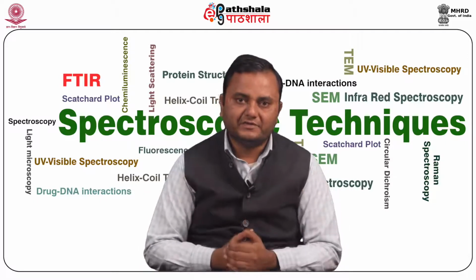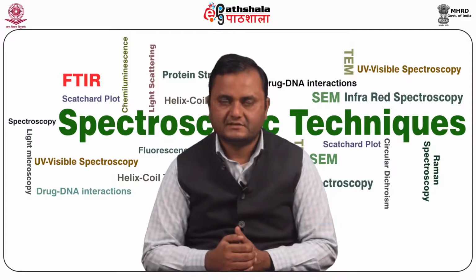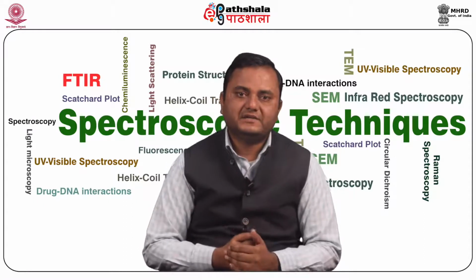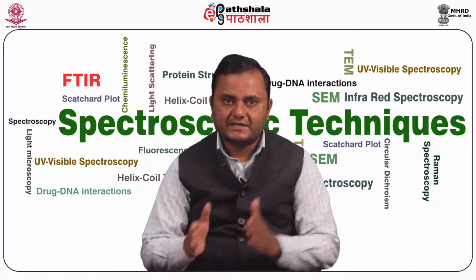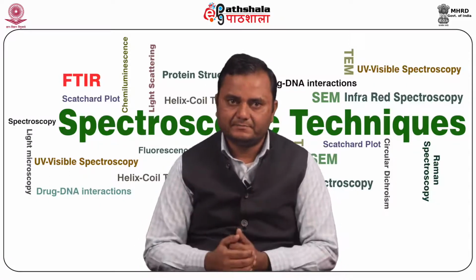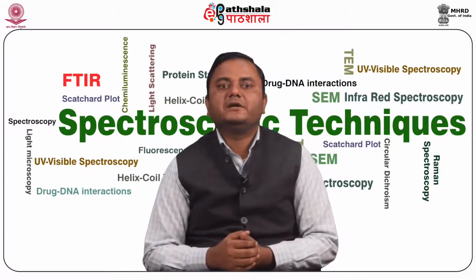The position of the moving mirror is expressed as optical path difference, and the optical path difference is the distance traveled by the red beam minus the distance traveled by the yellow beam, as given here. Now it talks about the components of FTIR.